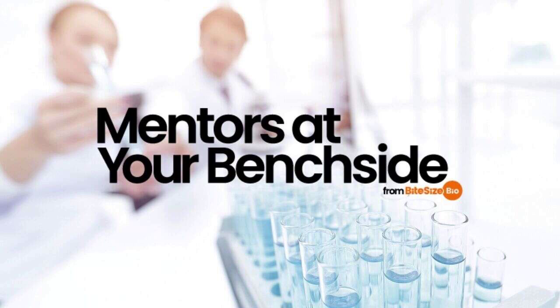If you have appropriate adapters, you can use a centrifuge with a swing bucket rotor to ensure your pellet is at the bottom of the tube, rather than on the side. To find out more about how rotor choice affects pellet placement, watch the webinar on centrifugation basics from Eppendorf, linked in the episode description.